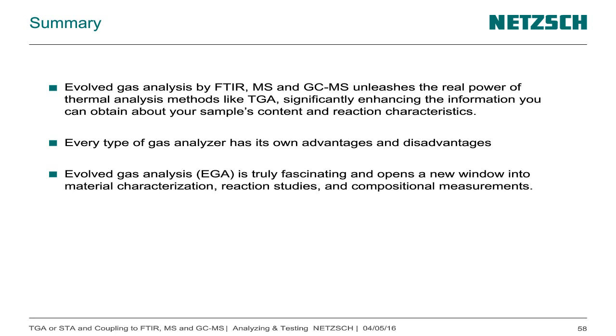Okay, thank you. Can we use the MS as a sole instrument, in the coupling STA-MS or skimmer STA-MS? I mean, in another experiment, connected directly to a thermal reactor without STA analysis. If you have a mass spectrometer with a transfer line system, this is totally easy to connect to every other instrument, and you can use it as a standalone. You must think a little bit about cold spots, but if you are aware of how to prevent them, it's no problem.